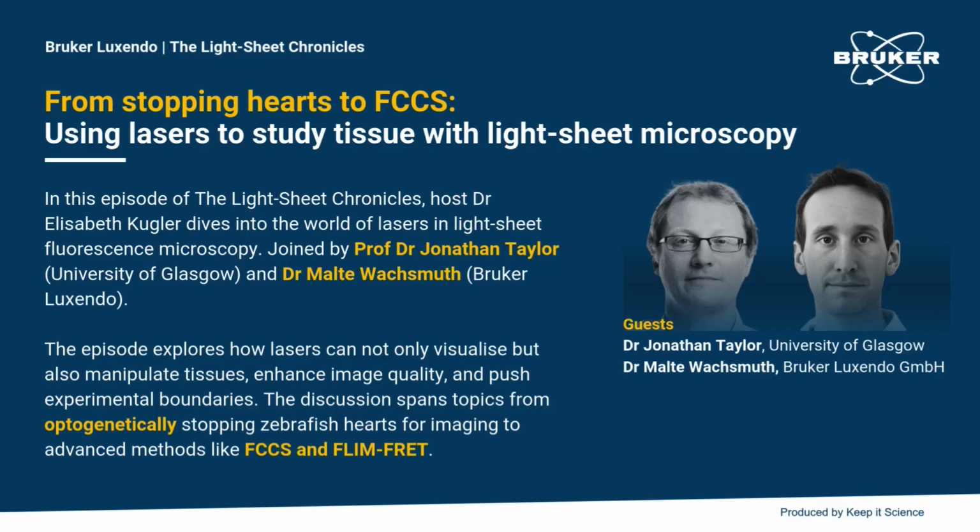But then for samples that are constantly moving, with the heart being the extreme example of that, you've got the problem that you're wanting to capture a series of images and understand the biological changes that are happening on a time scale of minutes to hours in that tissue, whether that's cell division, cell migration, changes of state of the cells. But then if you're completely overwhelmed by the large beating motion of the heart several times a second in the case of the zebrafish, you're not able to see the structures and the phenomena that you're wanting to understand.